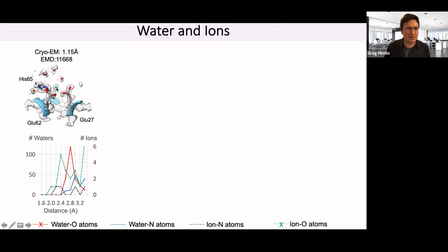But anyway, the procedure finds that this blob in the center is likely an ion, and this actually corresponds well to what was in the crystal structure. That's because it was within maybe 2.2 angstroms of these charged oxygens and this nitrogen.